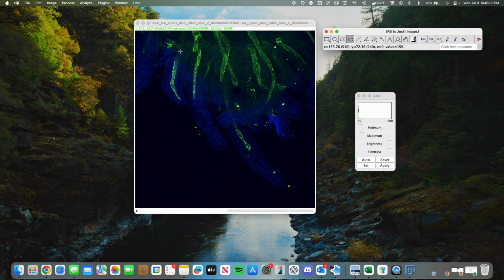But we can try our best to move, and we want to get through the center of this lacteal. The lacteal is kind of like a guide for measuring through the center of the villus. And then we would just end at where the tip seems to be. So we can take our first measurement. We're going to drag our mouse as we press through to the end.